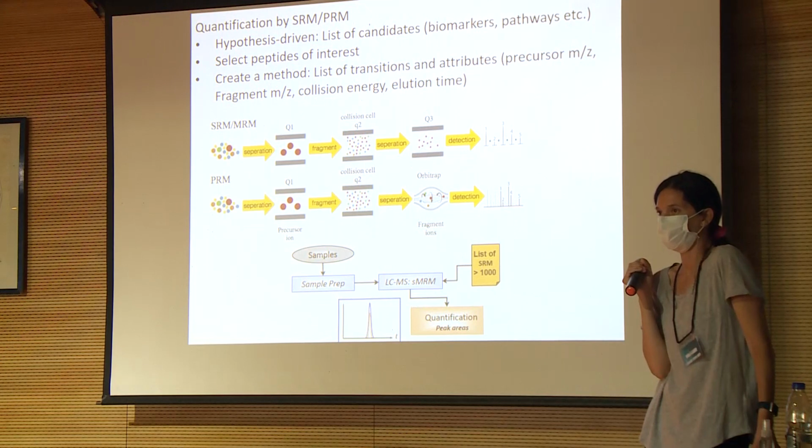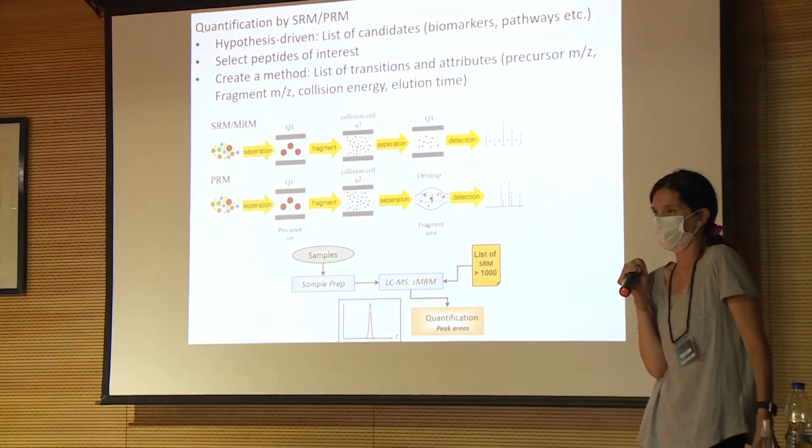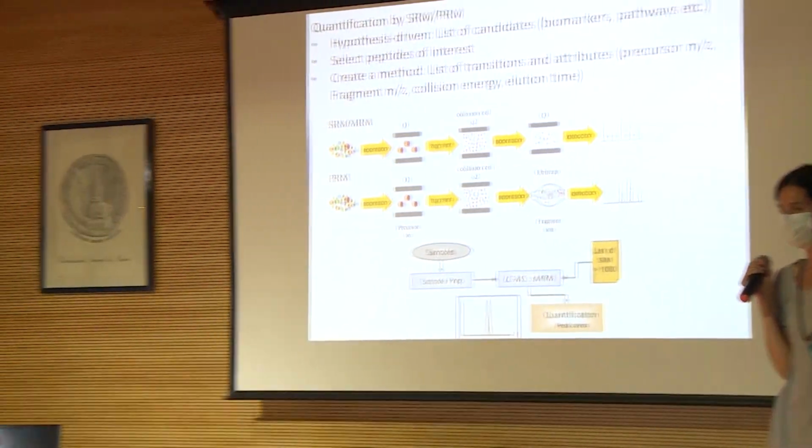That is a top-down strategy. And in bottom-up, you will have peptides, as Pia said, with trypsin cutting after arginine and lysine. On average, you have one lysine or arginine every 10 amino acids, so the peptides are almost all the same, between 8 and 14 amino acids. So you are very well inside the range of the mass spectrometer.